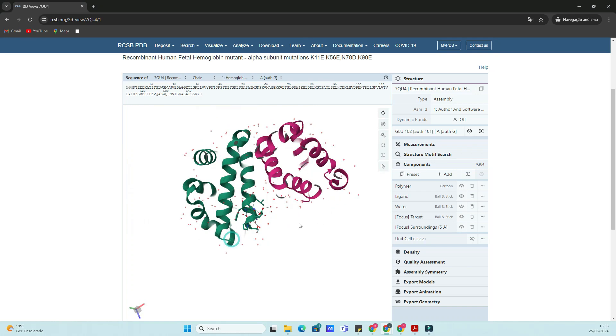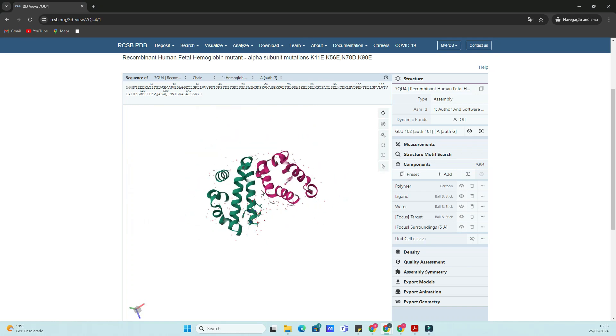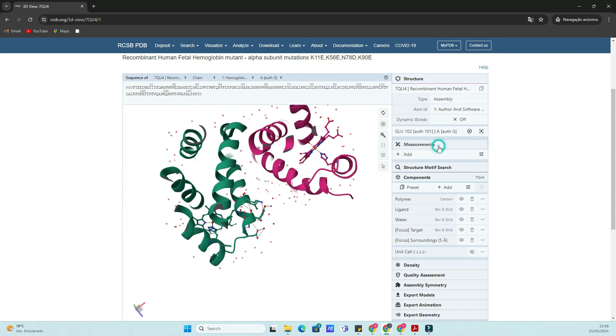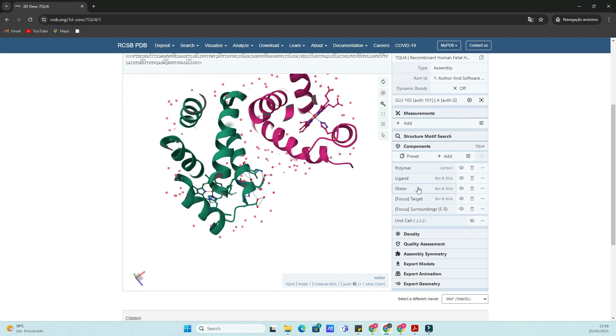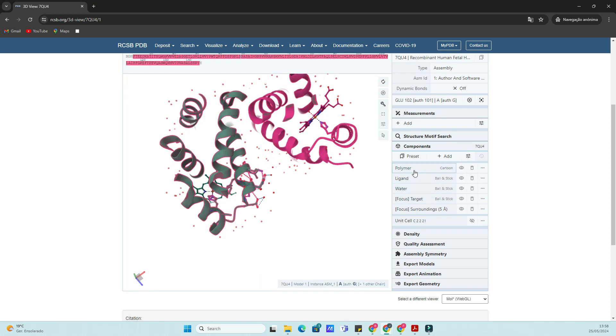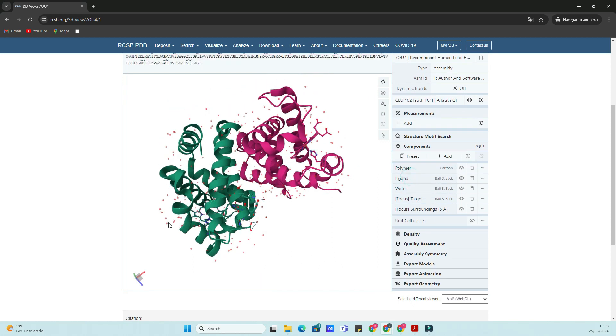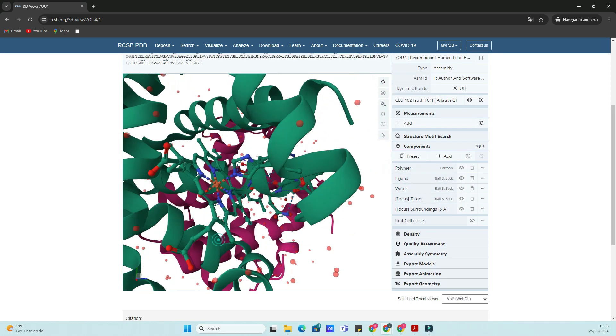Next, let's check out the 3D View tab. This is one of the most exciting features of the PDB database. Click on the Structure tab.